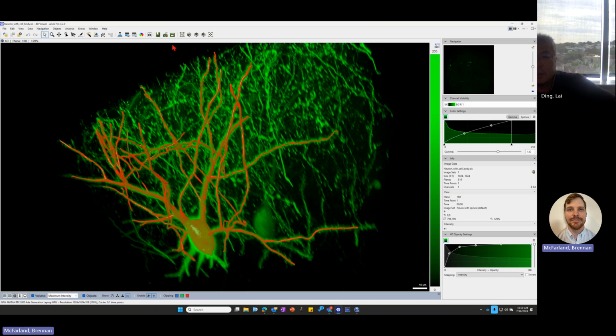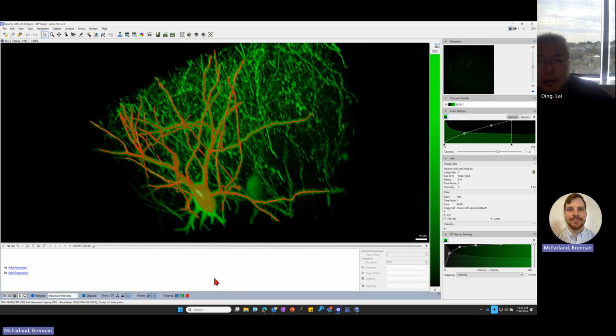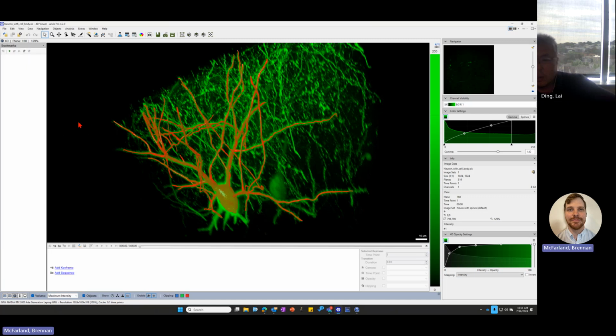Off. Okay. And then if we want to go and create a movie, it's called a storyboard. So we'll go and click this on, and this is the GUI for this. The other thing I'll point out is we have this toggle bookmarks. And this is really useful because think of this as like you're saving your settings in place.